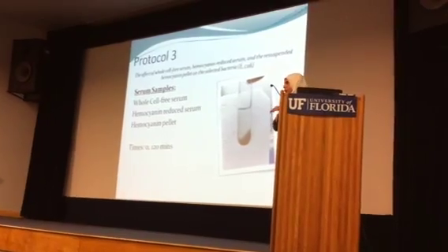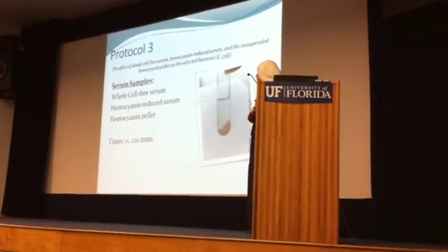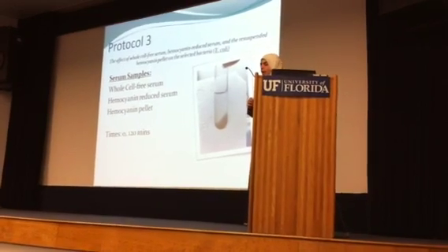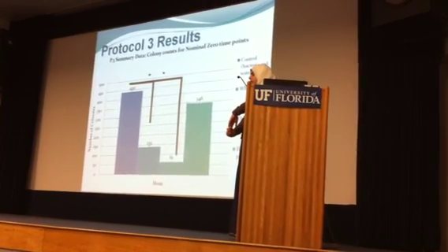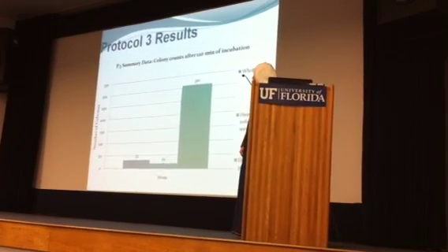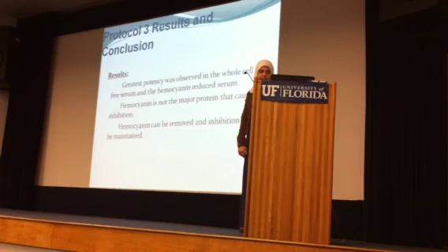For my third protocol, I used centrifugation in order to remove the hemocyanin, which is the major protein found in the serum. And I tested the whole cell-free serum, the hemocyanin-reduced serum, and I also resuspended the hemocyanin and tested that against the bacteria. And at nominal time 0 compared to water control, the whole cell-free serum and the hemocyanin-reduced serum had the greatest reduction. And even after 120 minutes, the number of colonies further decreased with both those samples. Therefore, I found that I could successfully remove the hemocyanin and still maintain inhibition of bacteria.